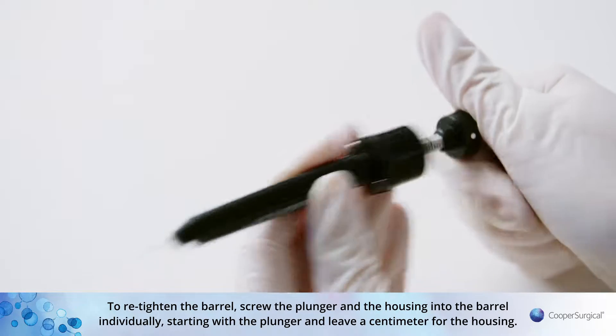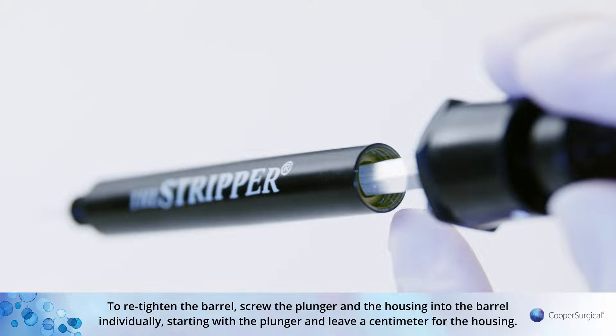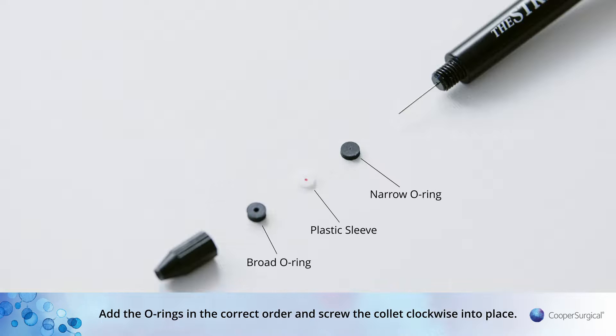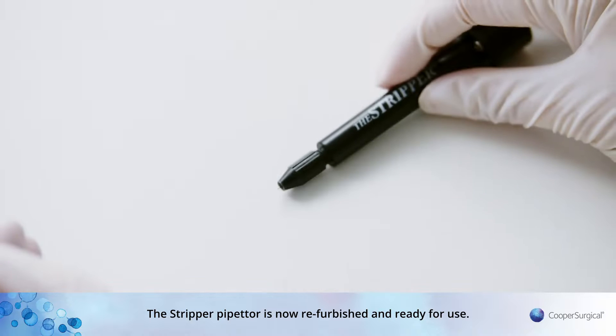To re-tighten the barrel, screw the plunger and the housing into the barrel individually, starting with the plunger and leaving a centimeter for the housing. Add the O-rings in the correct order and screw the collet clockwise into place. The Stripper Pipetta is now refurbished and ready for use.